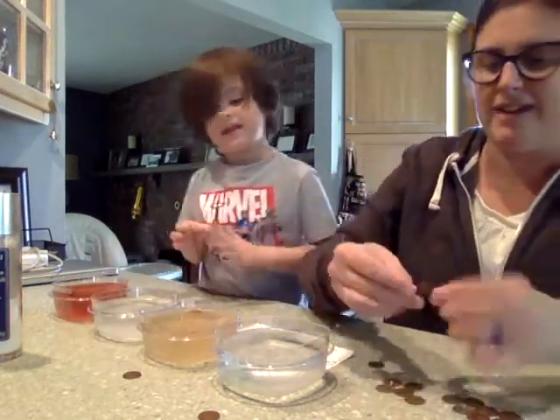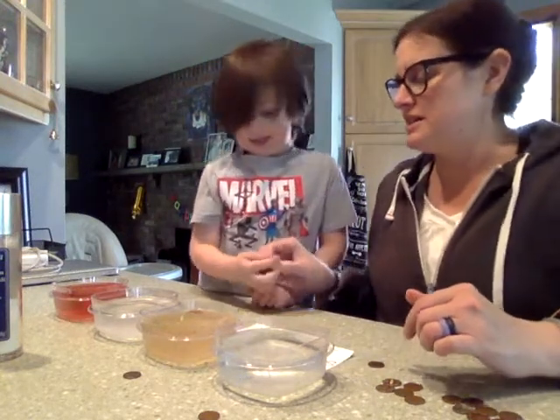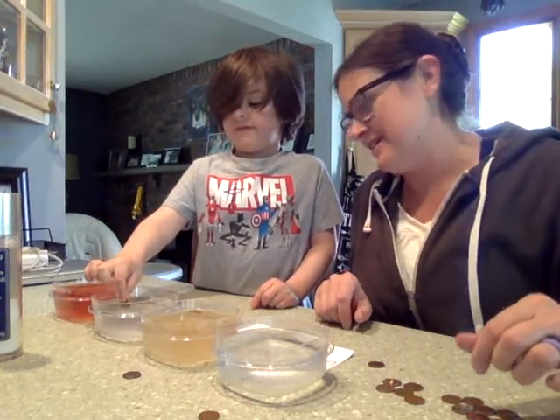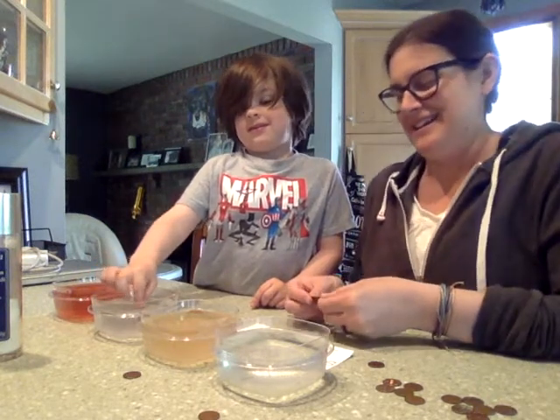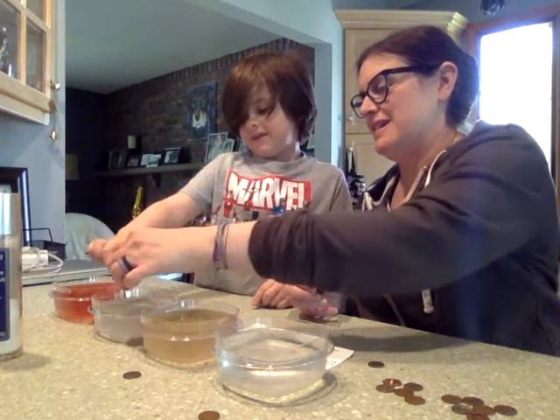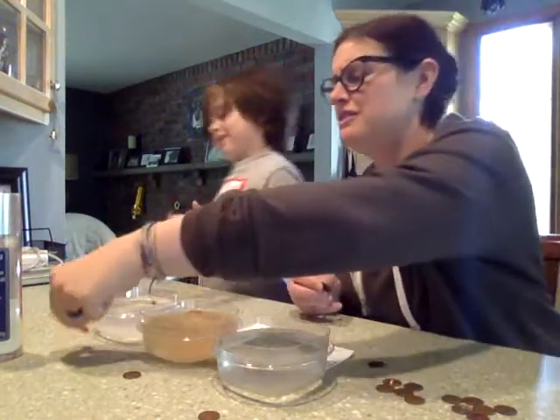Next up, it's just wet. Next up we have the salt solution. We're going to count to 15. Okay. And just wet on that one too. No change.